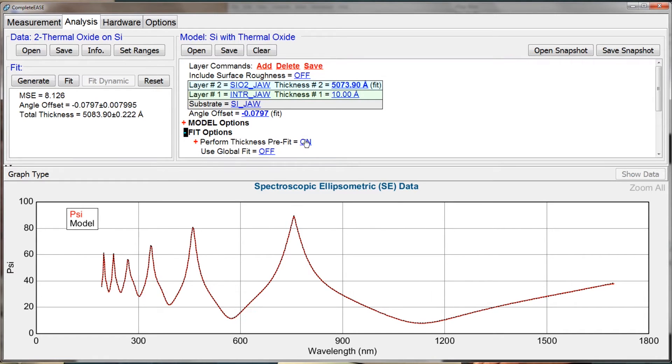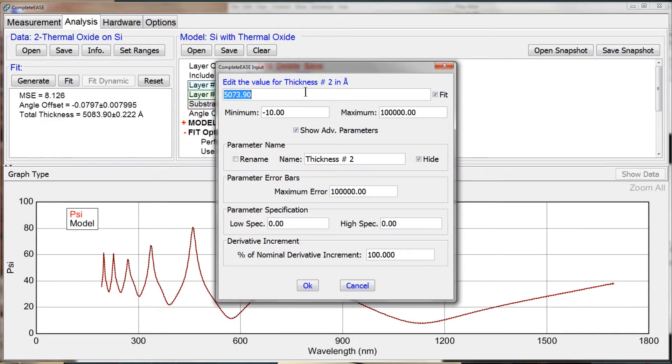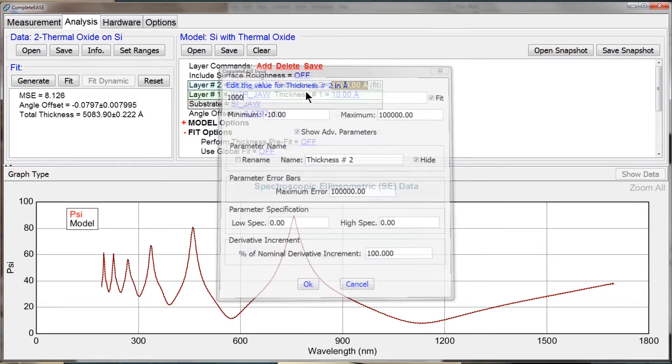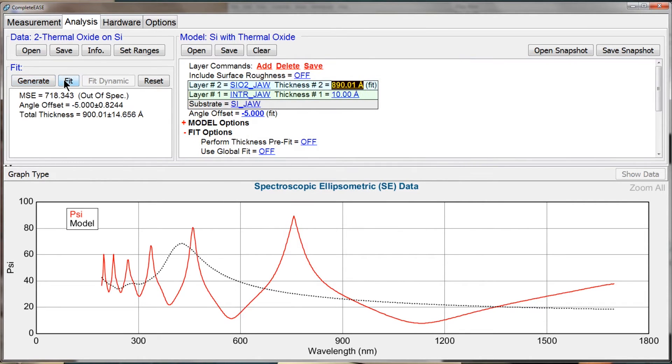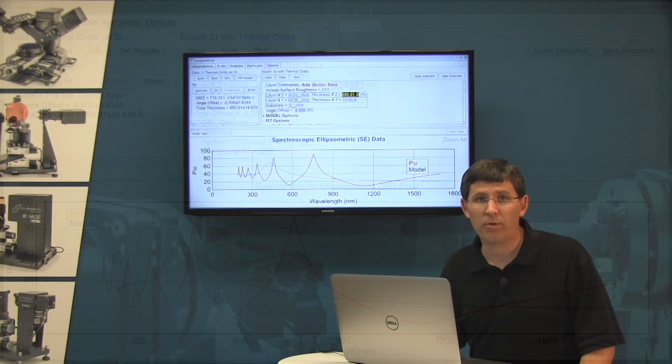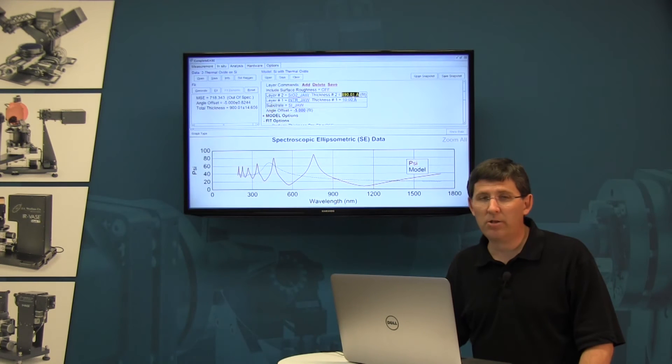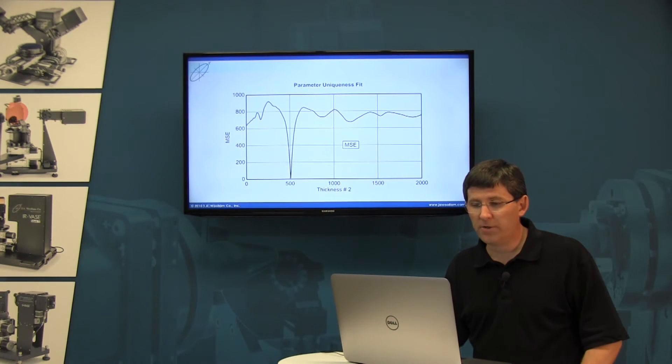Let me turn off the thickness pre-fit, which I'm going to show you, and type in the wrong thickness. And now if I press fit, it can't find the correct result. I have to be close to the final result in order for it to fall down in this valley.